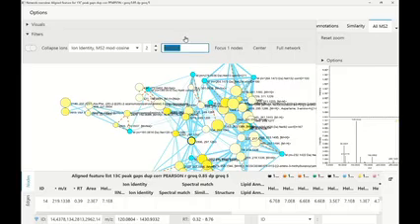This very much depends on the spectral library, if they provide this. But Corinna is going to show a spectral library generation workflow later. There, for example, we have a script that already gets, from the structure, all the different bio IDs and gives you all the different IDs, clean structure and everything else.